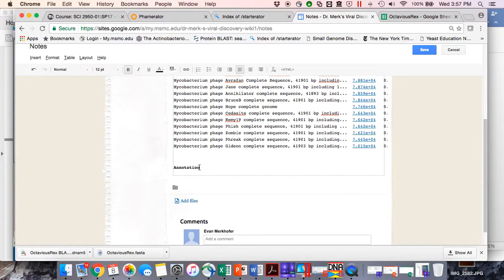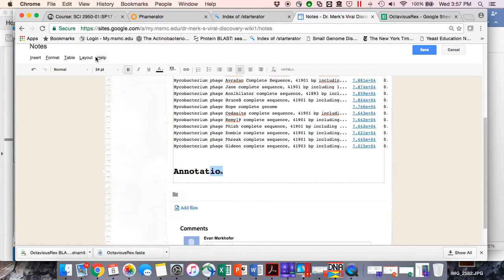I'm going to make this a little bigger. And we're going to start with gene 2, or sorry, gene 3.